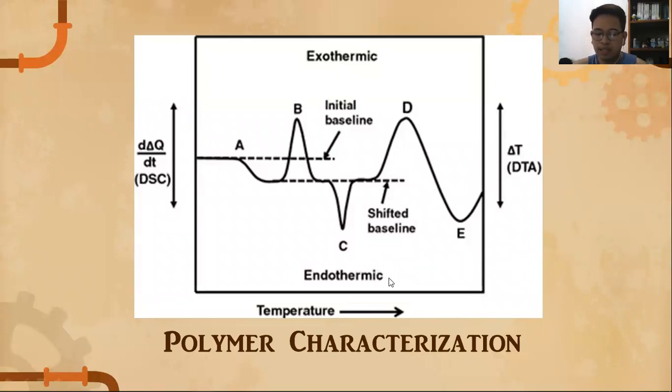Here is a typical DSC curve of heat flux versus temperature or time. As you can see here, there are two conventions, exothermic and endothermic. For an exothermic part, a sample may have a positive or negative peak depending on the kind of technology used within the experiment. Through DSC, enthalpies of transitions can be obtained by integrating the peak corresponding to a given transition.